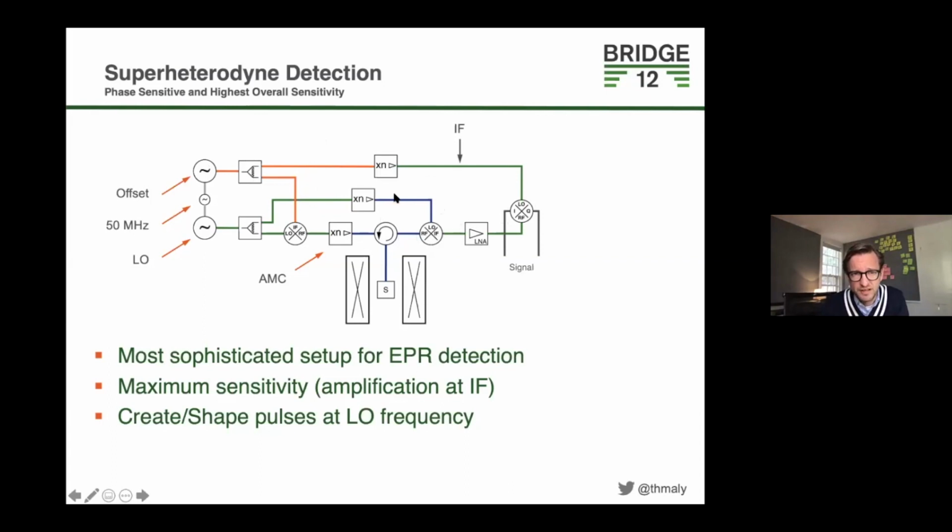And technology. So the really difficult part, you isolate to this part here, and also the low noise amplifier. It's always better to amplify at a higher frequency rather than DC for noise issues. This system here will give you the maximum sensitivity with this intermediate frequency arm. That is, by the way, a very general scheme here. This is how your NMR spectrometer works. It's exactly the same thing.